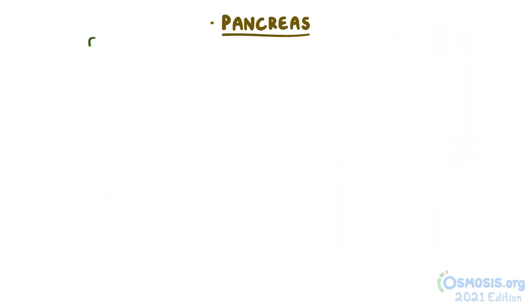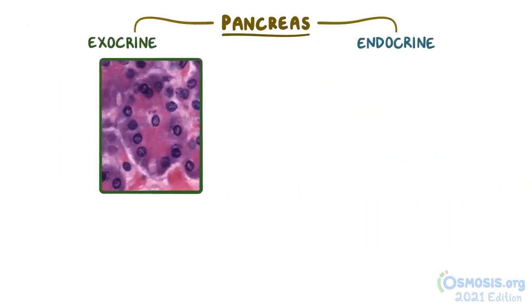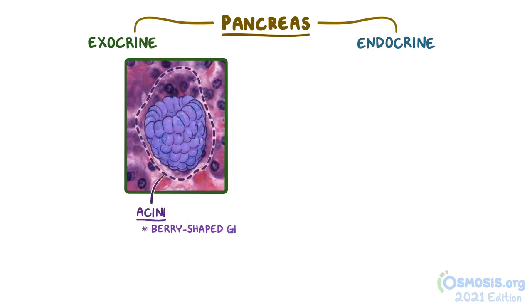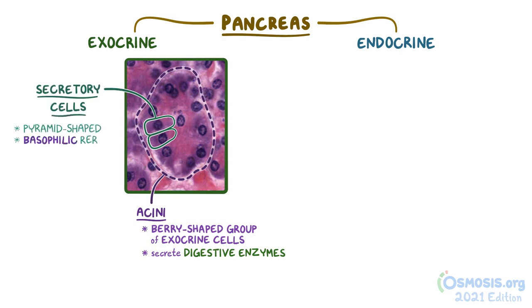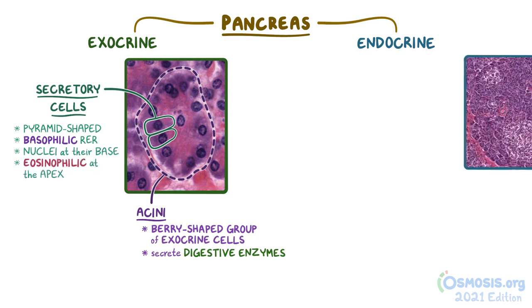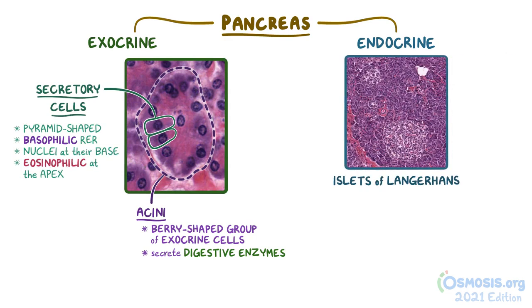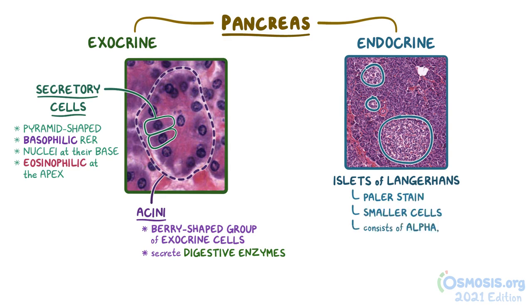As a quick recap, the pancreas has both exocrine and endocrine functions. Acini are the berry-shaped groups of exocrine cells that secrete digestive enzymes. The individual secretory cells are pyramid-shaped with basophilic rough endoplasmic reticulum and nuclei at their base, and eosinophilic granules at the apex. Islets of Langerhans are responsible for the pancreas' endocrine secretion, and are seen with H&E by their paler stain and smaller cells when compared to the surrounding tissue. The islets consist of alpha, beta, delta, and PP cells, with beta cells making up about 70% of the islets.